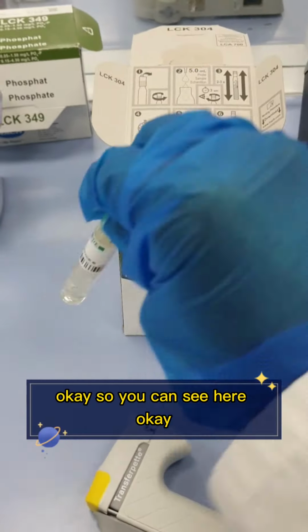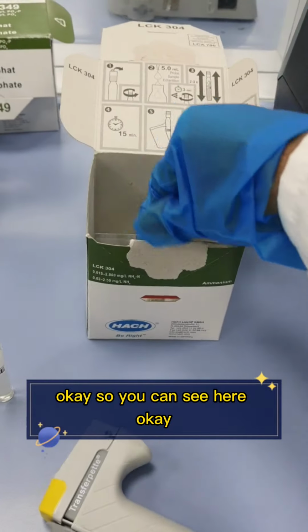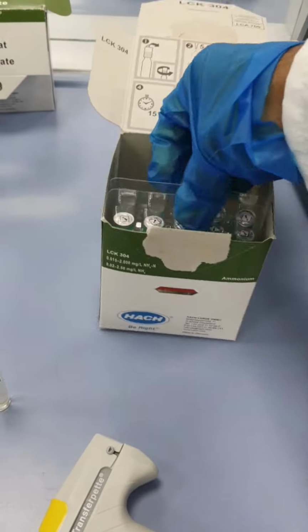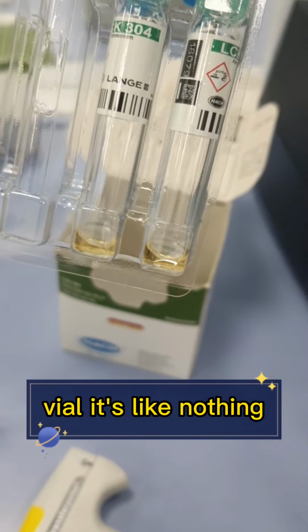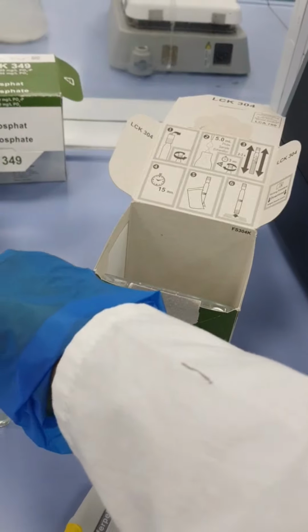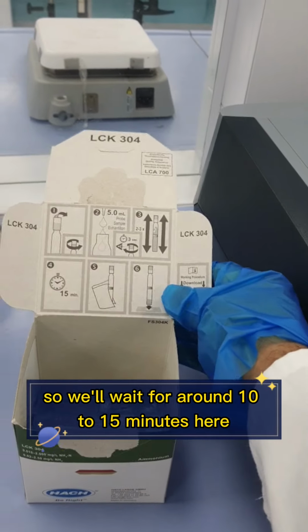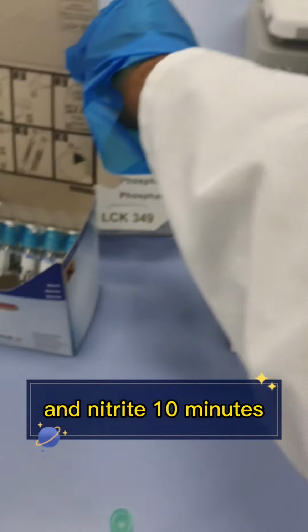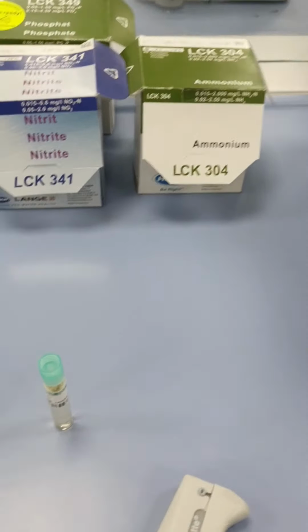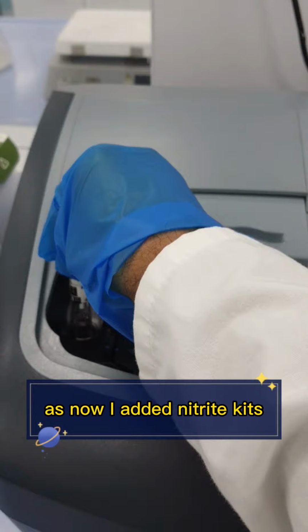So you can see here the raw vial, it's like nothing, it's like yellow. So now it's changing. So we'll wait for around 15 minutes here, and nitrite 10 minutes, and phosphate also 10 to 15 minutes.